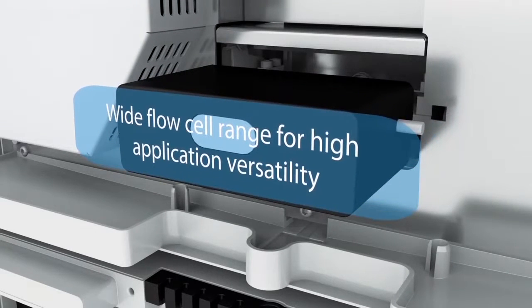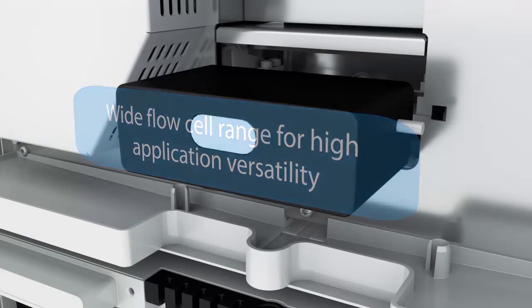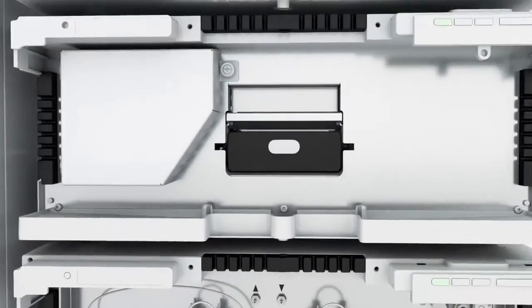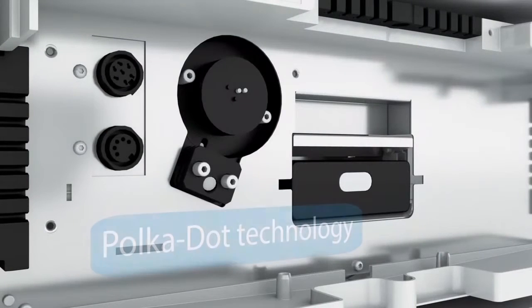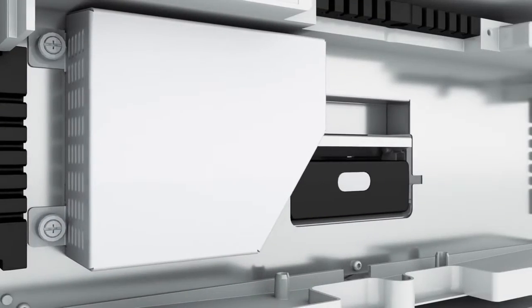Flow cells as well as lamps can be easily exchanged from the front side. The Knauer Polkadot technology enables maximum light intensity and low noise over the whole UV-VIS spectrum. This technology provides more light than previous shine through lamp configurations.